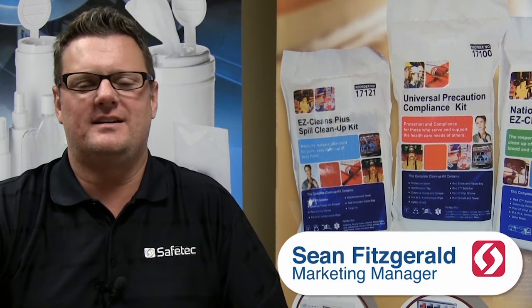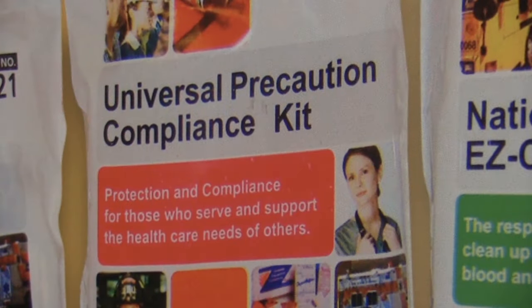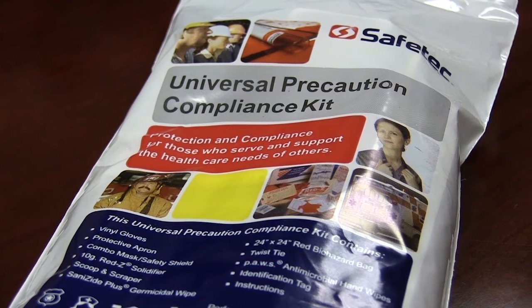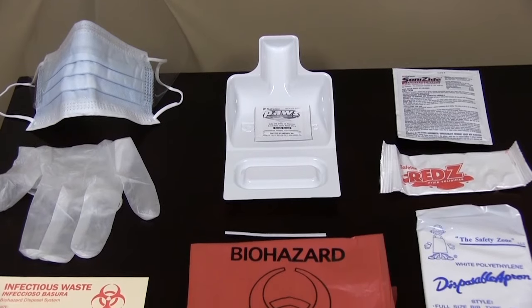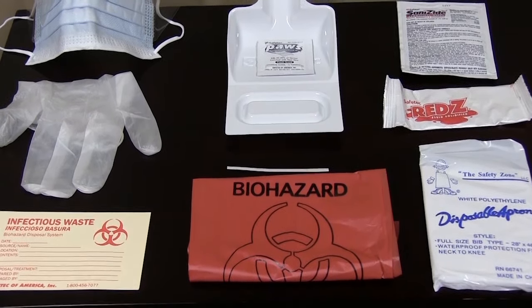Hello, I'm Sean Fitzgerald, Marketing Manager at SafeTech of America, Inc. In this video, we will show you how our popular Universal Precautions Kit can help you comply with OSHA standards. You'll also hear from Chip Obie, a Sales Specialist here at SafeTech of America, on the five steps to properly contain and remove a spill.